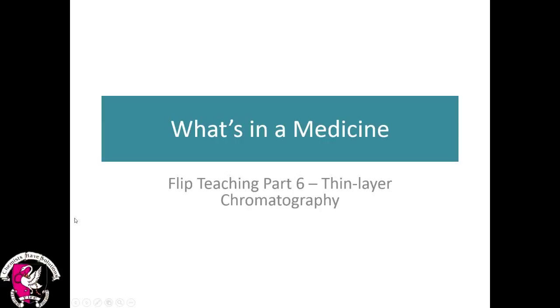Okay, so today we're going to be looking at thin layer chromatography, which is very similar to another type of chromatography that you would have already definitely looked at, which is paper chromatography. Quite a lot of the terminology and the principles behind it are similar, so we're just going to build on that and explain basically what this is and why it's used.